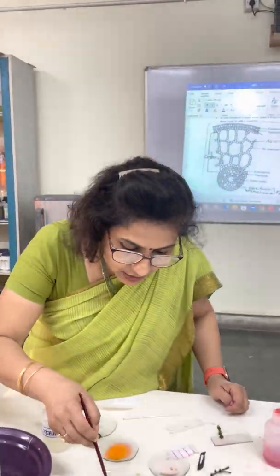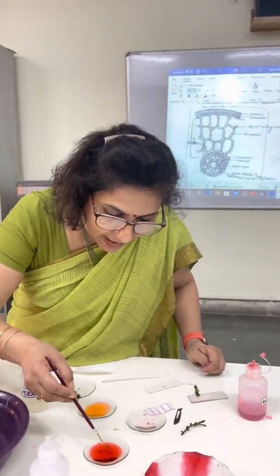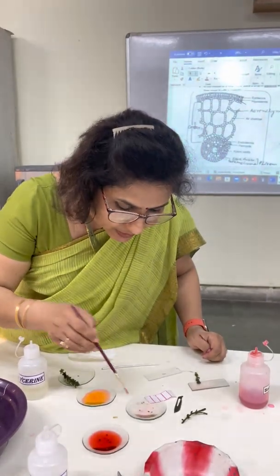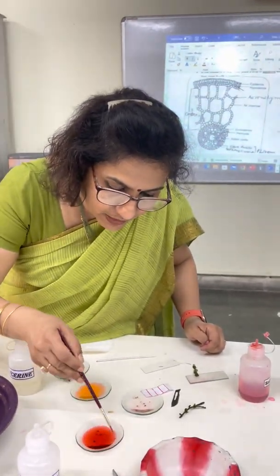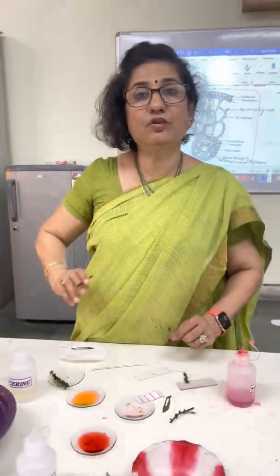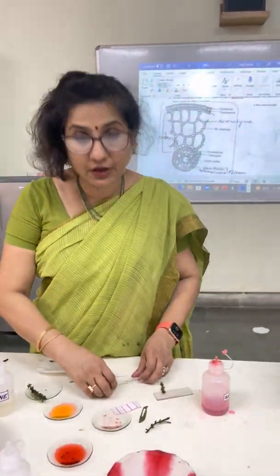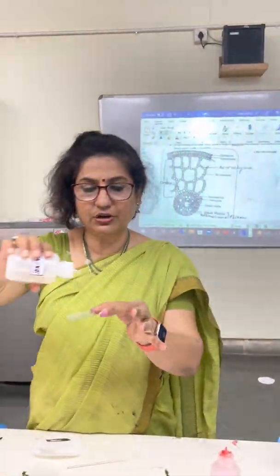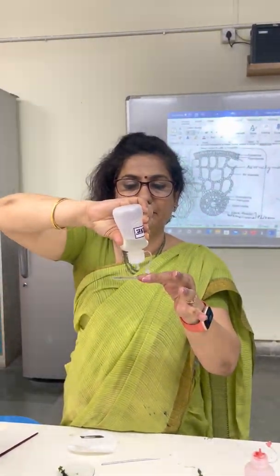Let it remain in water with the safranin for 5 minutes so that it takes the stain. Now I transfer it back to water so that the extra safranin is washed out. Now I select the thinnest piece and take a slide, and put a drop of glycerin on it.